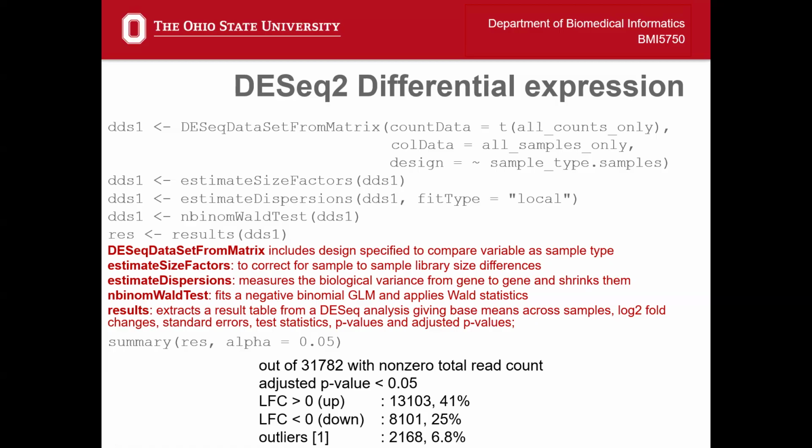And it shrinks them. It's trying to minimize just general gene expression changes that are not biologically relevant. They're just minor changes throughout our data set. They're not strong, they're not meaningful, and so it's shrinking the variance of most of our genes.